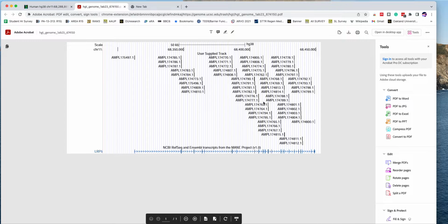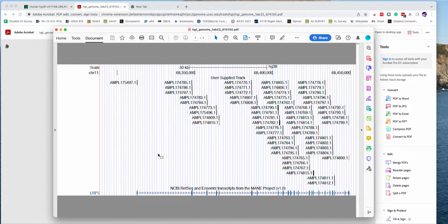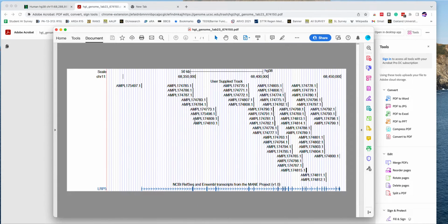You can see that's the graphic of the tracks. Download it, just so we get it. The nice thing about that is when we do get it, I've just dragged it, it opened up here, and because it's a PDF, it can be scaled to any size. This is the PDF file I need from you, okay?